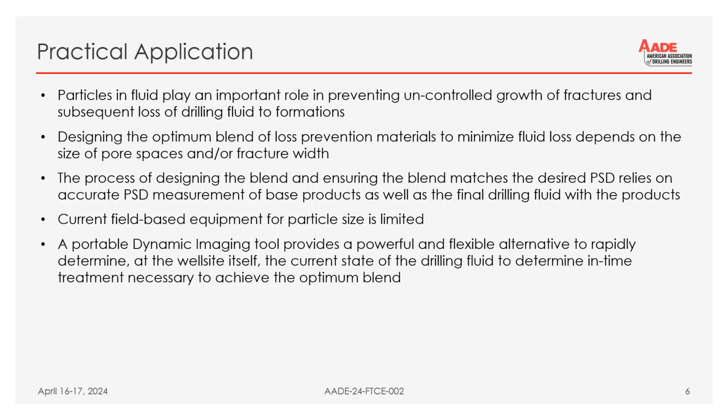So dynamic image analysis is a very simple tool. Again, you're just taking pictures of these particles as they go by, and it has the ability of getting high resolution at the well site, but it also gives you the ability of making the decision right then and there. So the value of being able to make a decision right at the well site with an enormous amount of added information is of great value. And we're going to talk about the added information in a minute.